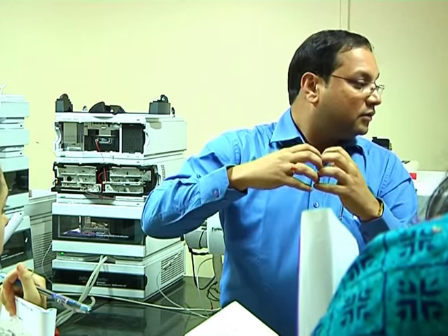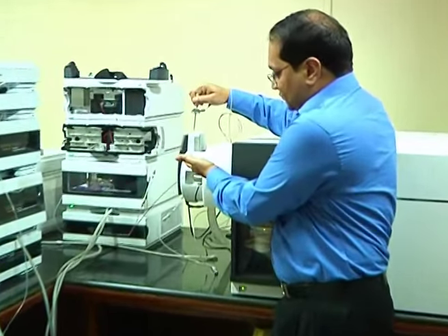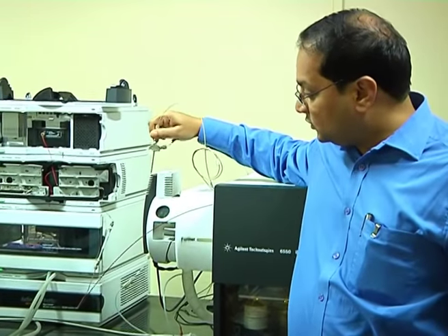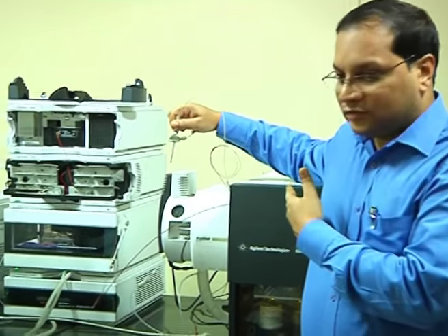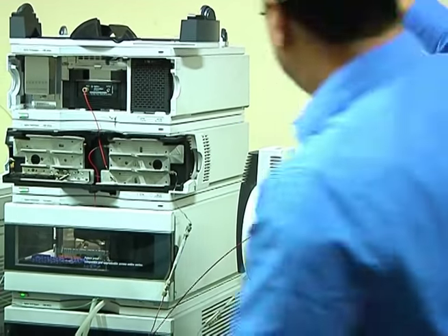Nitrogen has to be an inert gas, otherwise it would react and form something else inside. Right? This is how the spray will happen. This is the spray. I showed you the droplet. Now you see the spray. You could see it.